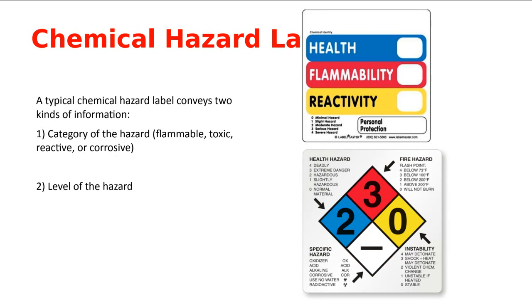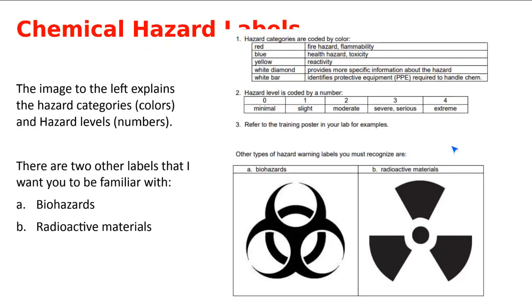The second category is a number that communicates the level of the hazard. Zero is minimal, one is slight, two is moderate, three is severe, and four is extreme hazard. That covers the hazard communication system for the bar label and the diamond label.